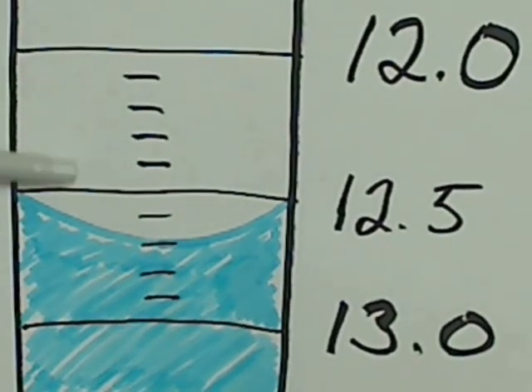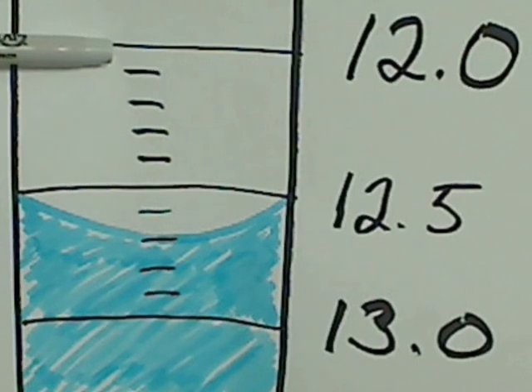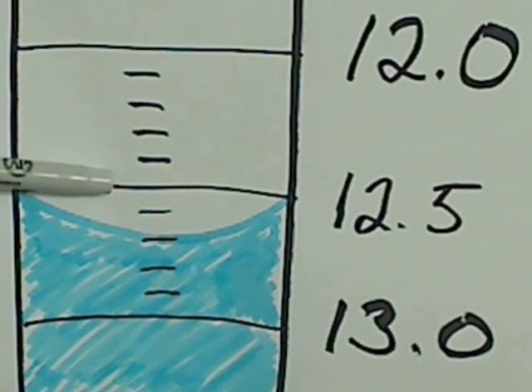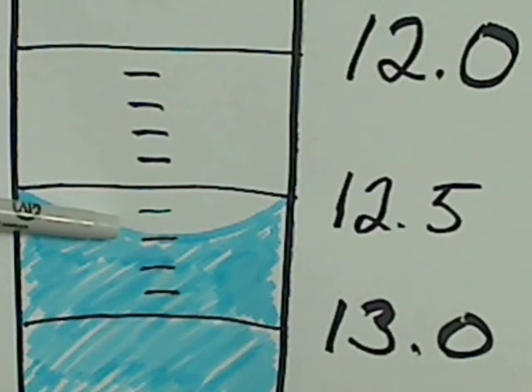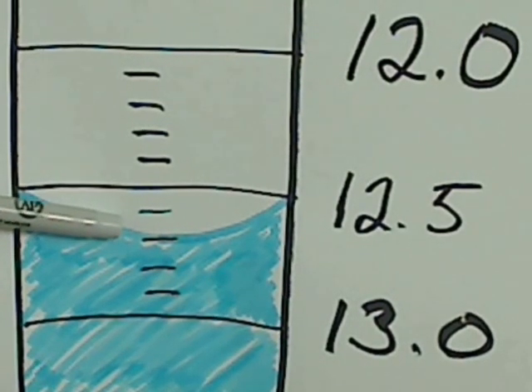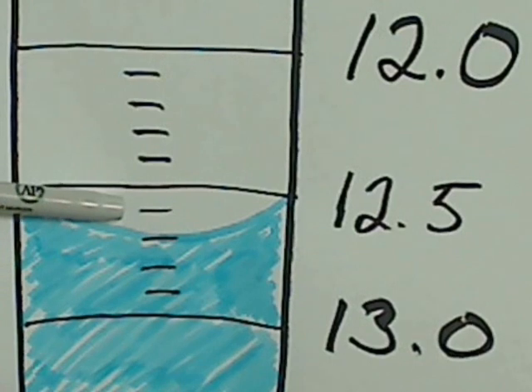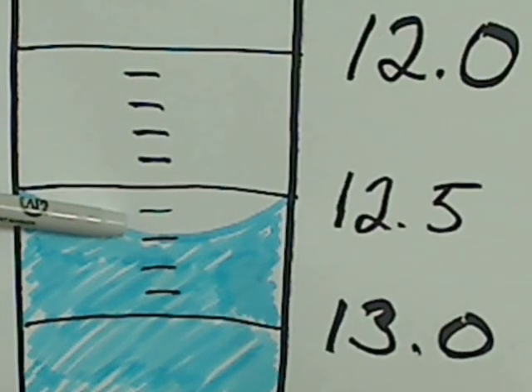So this meniscus right here is going to be 12.6, almost 12.7, but if you can estimate that last digit, I would actually estimate this as 12.69 milliliters.